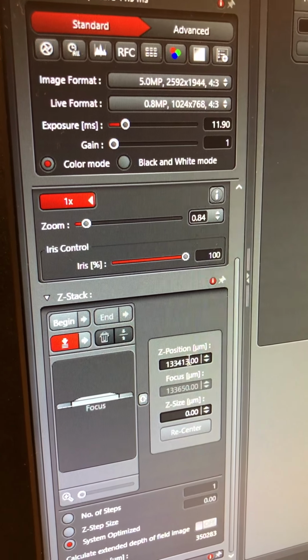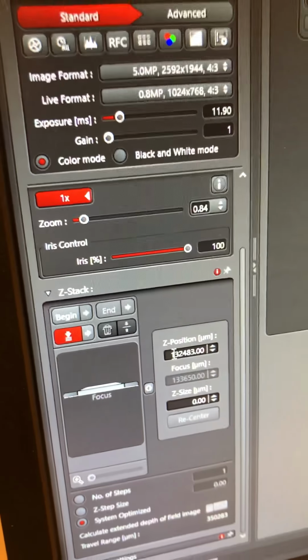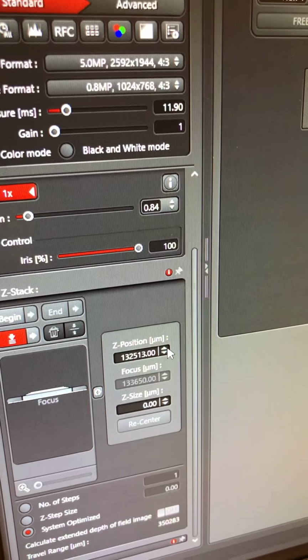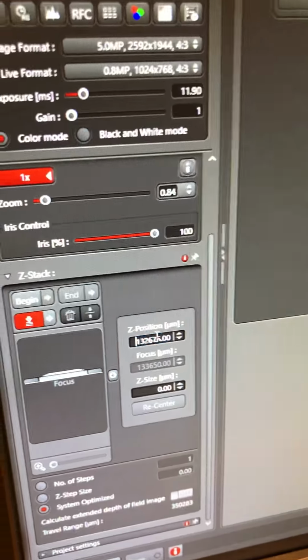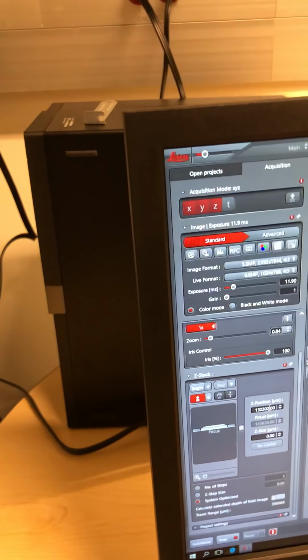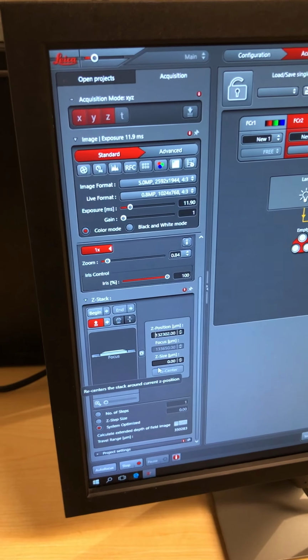You'll notice that when she moved that, this was moving, right? The other thing I can do is use this jog dial on the mouse, which I like to do. Or you can go in here and manually click or type in. Because you went through the reference program at the beginning, those numbers are in theory reproducible. That's correct. There's clearly going to be some limit to that reproducibility, in nanometers or something like that, but it should be a good reference point.